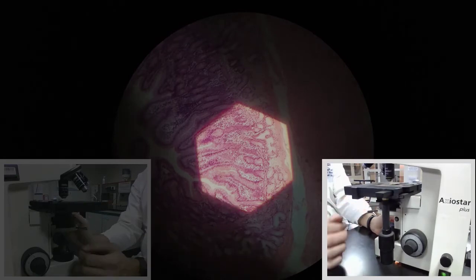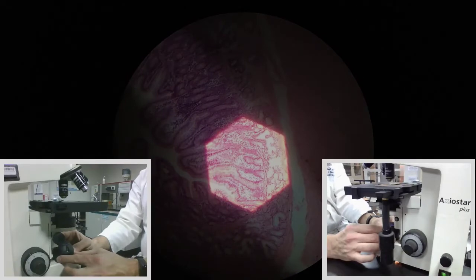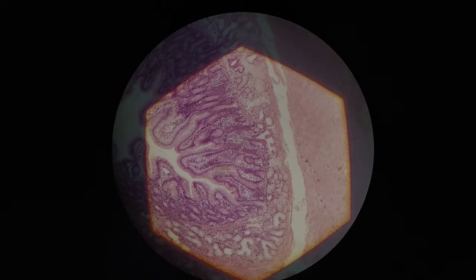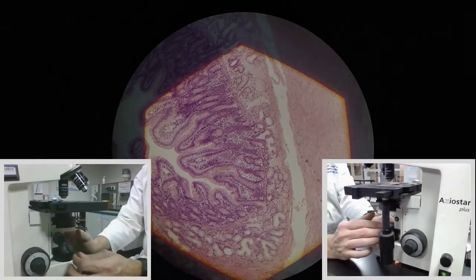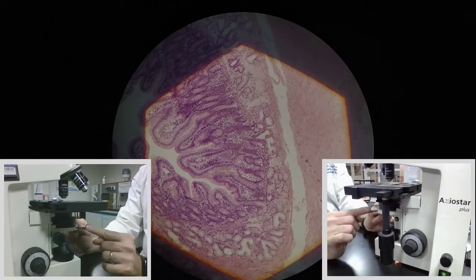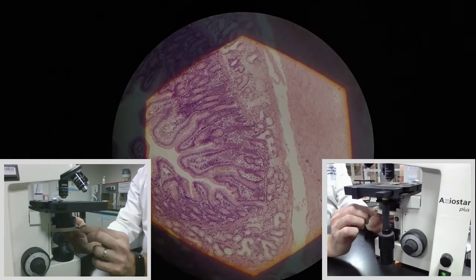At this point I have a fairly well-focused shape. I'm going to open this up a little bit. You'll notice now that if you look at the bottom right, the corner of this shape is just touching the edge of the field of view, but the top is pretty far away from the edge. So I need to center this shape. I'm going to use these centering controls — the screws on the sides of the condenser lens — to move it around until it's a bit more centered.